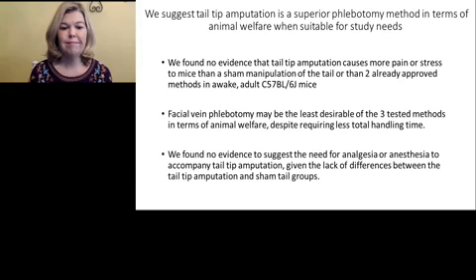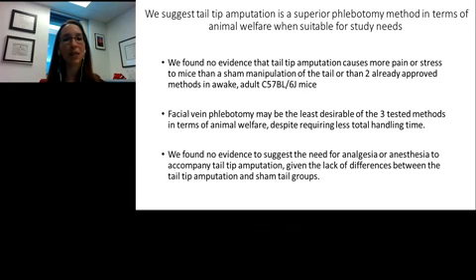I just thank you guys for listening. I think this is a really important topic that we keep evaluating, especially now as we get better and better metrics to evaluate our impact on mice. So I think there's still a lot out there that we can learn. I encourage other people to continue to conduct these well-designed studies to evaluate the impacts of phlebotomy on mice so that we can continue to improve our techniques, both to improve our data and also to have less impact on animal welfare.